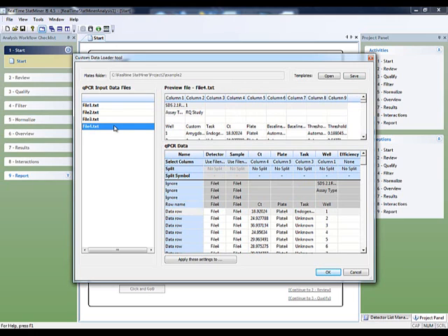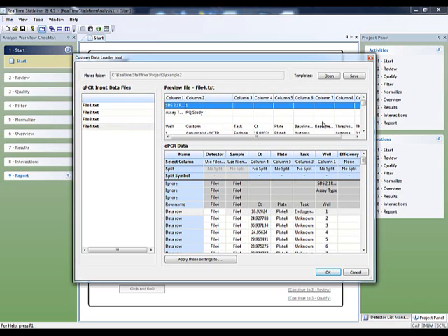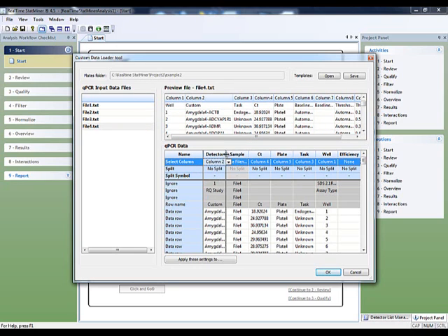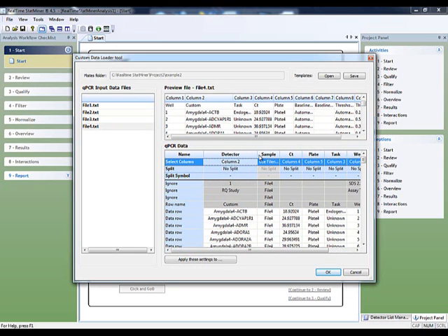We finish this tutorial with a strange but a real case where almost all of the information has been properly detected, but sample and detector names appear merged on the same input column. Not a problem. Proceeding in a similar way, we are going to select the column where detector identifiers are stored. Set the character separator. And determine which token represents the IDs. In this case, it will be the suffix. We can see in blue the information that will be loaded by the reader.